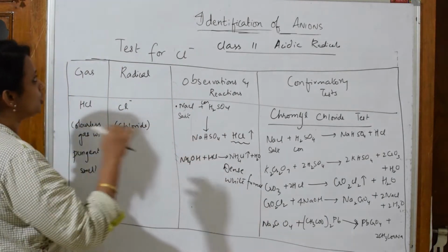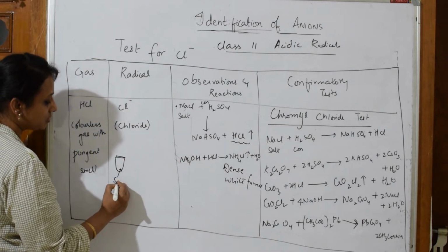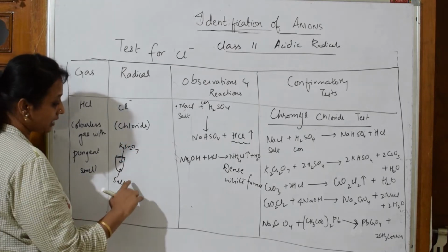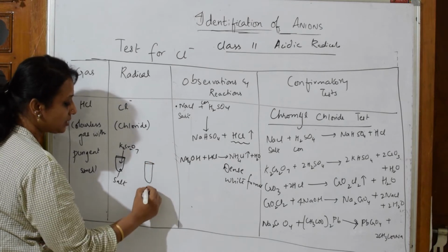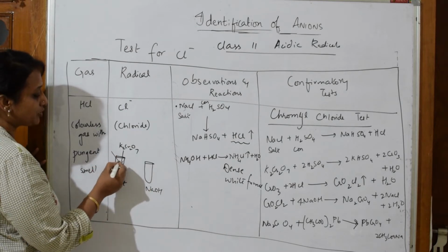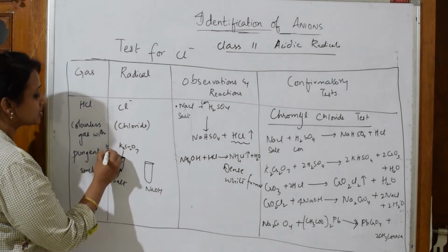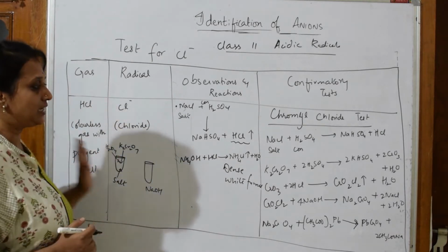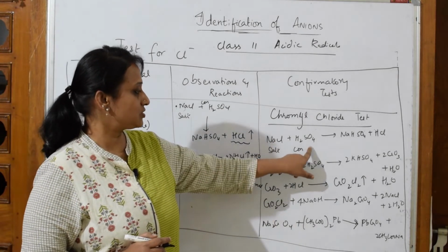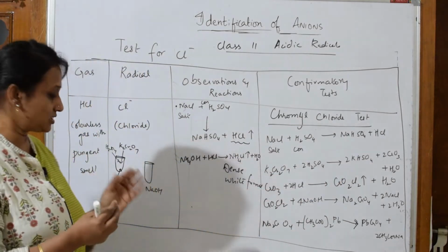Let us come back and draw what we have thought of. In the first test tube, you're going to take salt. To this salt, you're going to add K2Cr2O7. In the second test tube, you are going to keep sodium hydroxide ready. The final step, you're going to add the corrosive acid, concentrated sulfuric acid. Now this is ready, isn't it? Now observe: your salt, potassium dichromate, concentrated sulfuric acid. When you add all these, you keep this aside.